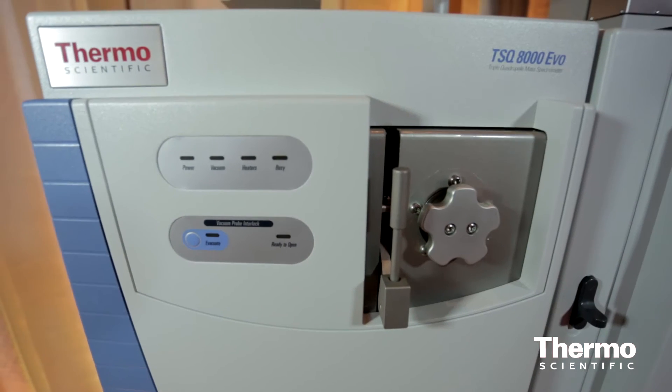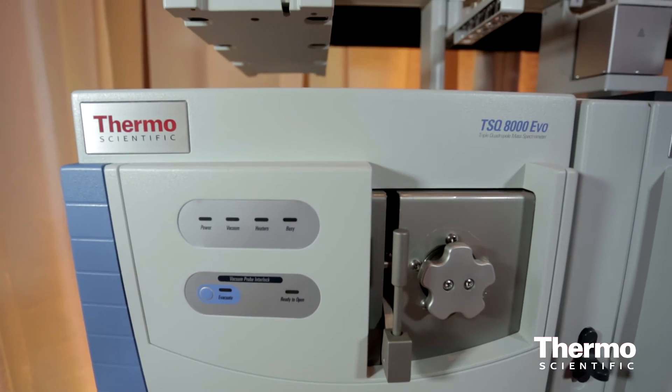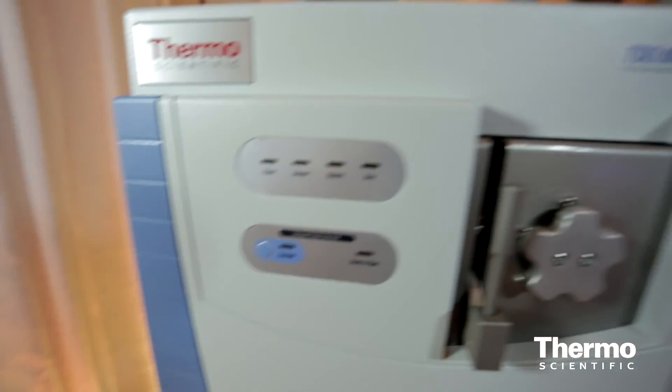So if you're in an environmental lab or a food safety lab, you really want to look at the new TSQ8000 EVO and the TSQ8000 EVO pesticide analyzer. For more information including the brochure and the new spec sheet, you can go to thermoscientific.com/TSQ and we'll have all that posted online there.